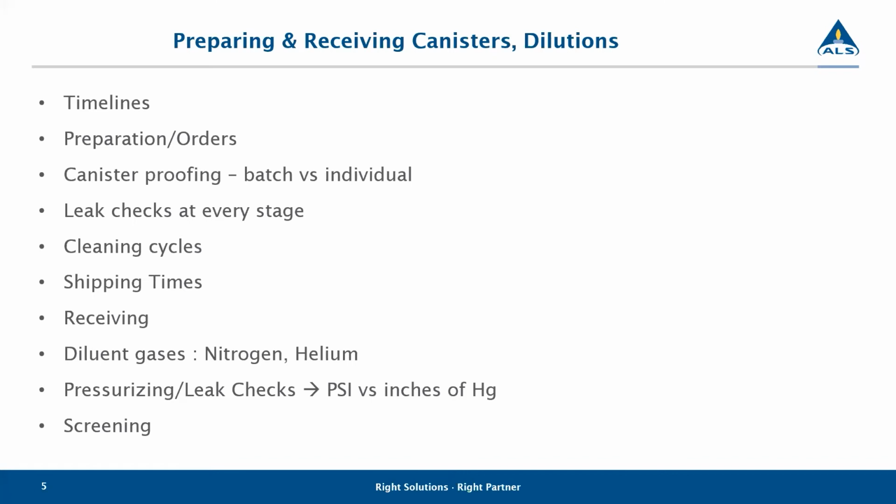At this particular point, we're getting greater than 90% recovery off of that particular tube. What we do then is we actually have a tube cleaning instrument, and so it goes back on that instrument again for cleaning. And we do batch proofing with the tubes. We don't individually proof every tube because of the high recovery on the instrument. And then when it goes through the cleaning cycle again, when we do this batch proofing, they come back virtually completely clean.